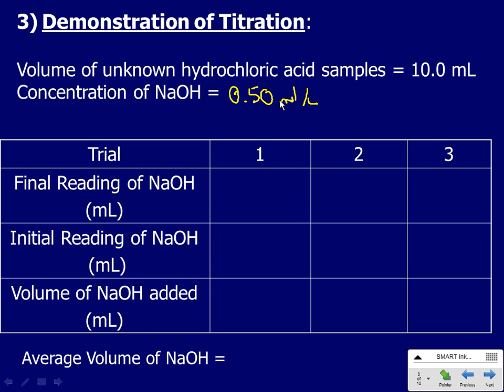I'm going to draw the liquid up. I'm going to pop that off and put my finger on it very quickly. I bring it to my waste container. In this case, I do have a sink. And I rotate it, and I let the liquid come out the end. And I rotate it and let the liquid come out the end there. And I'm going to do a triple rinse with that as well. And I'm only going to do this twice because it's just a demonstration. Draw it up. Put your index finger on it. All right. Rotate that. Let the liquid come out the end. And just let that final bit of liquid come out.